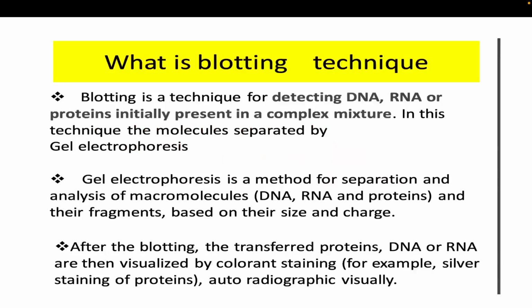So today we will discuss the blotting technique. Okay. So what is blotting? Blotting is a technique for detecting a DNA, RNA or protein sample which is initially present in a complex mixture.